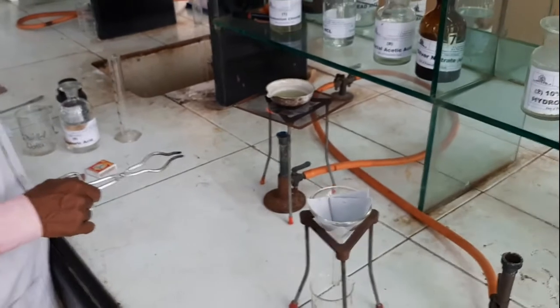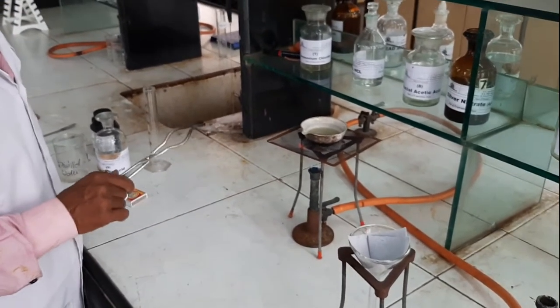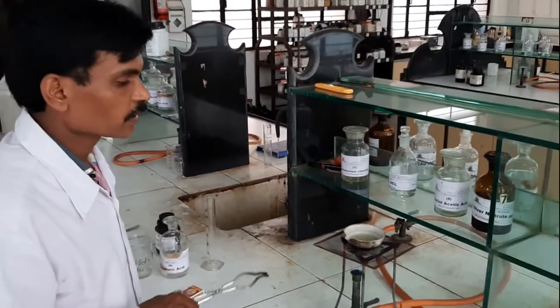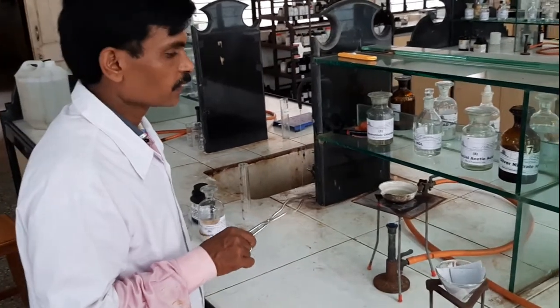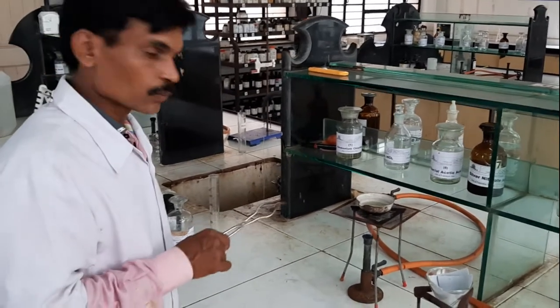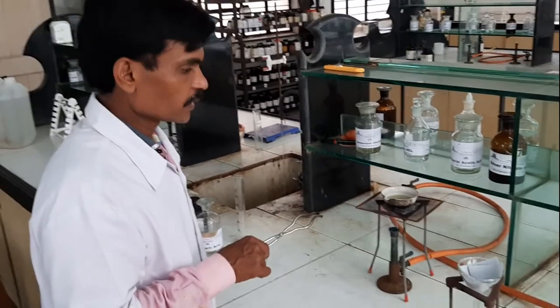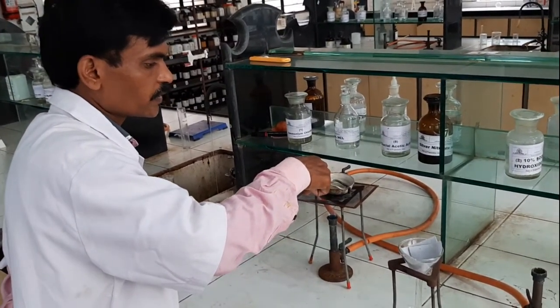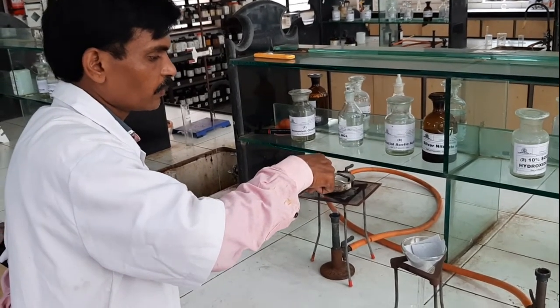We have to ensure that the iron powder completely reacts in the dilute sulfuric acid solution. Allow it to completely react so that the H₂ gas is completely ceased. Whatever green solution is obtained, we have to concentrate it in the porcelain dish. Right now this solution is being concentrated — we will wait for 10 minutes.